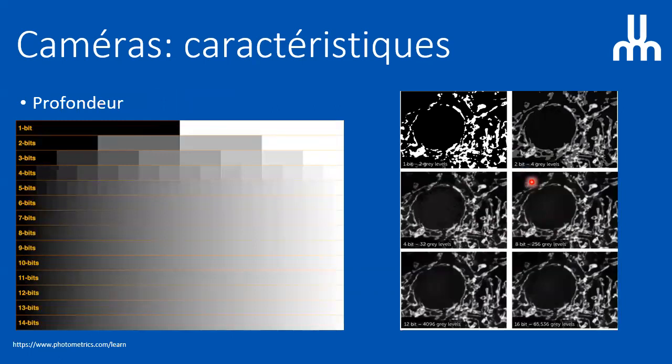An important characteristic about the camera is also the depth of the well. So if a pixel is a bucket getting water and it's very, very deep, then you can put a lot of water and you can still measure how much water you have. If you have a 1 liter bucket, then you're just going to be able to measure between 0 liter and 1 liter. But if you have a 10,000 liter bucket, you can measure a lot of difference in terms of volumes. So you can really think about the pixel as a bucket, and the depth is important because the higher the depth, the more details about the brightness you can measure.